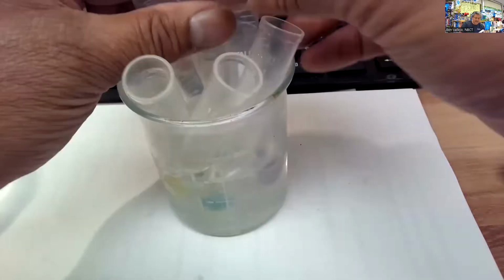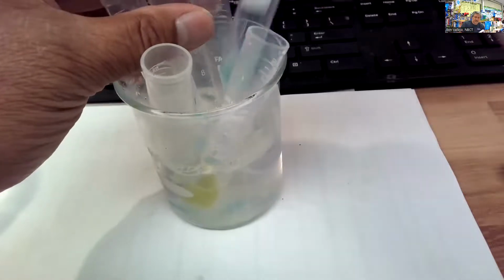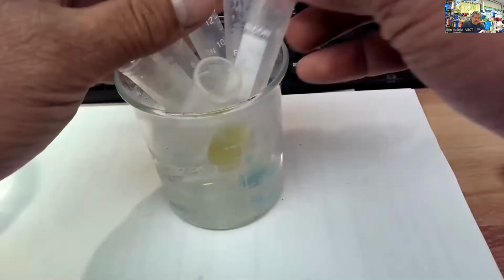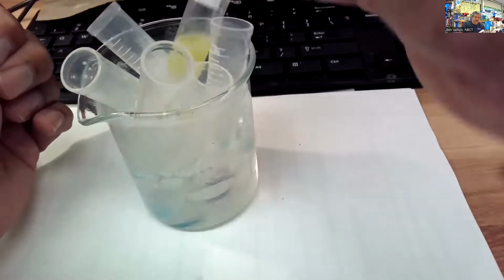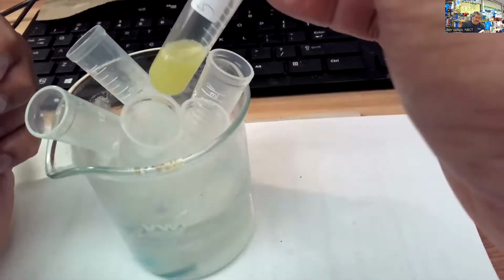It's a little purplish, isn't it? And number 4, still quite blue. That's the oatmeal. Okay, here's number 5, the juice. Guess what? Does juice have sugar in it? Does juice have a glucose in it, a monosaccharide?